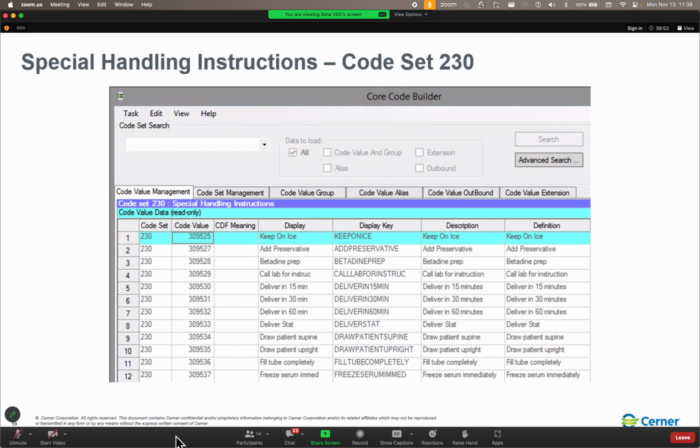So, very important. I'm just going to move them all over. Go to the lower right-hand side and click next. And now we are at the Define Collection Requirements screen. Again, I don't know if you noticed, but not only are all of our orders Gen Lab orders, they're actually all chemistry orders, assuming that I selected them all correctly.